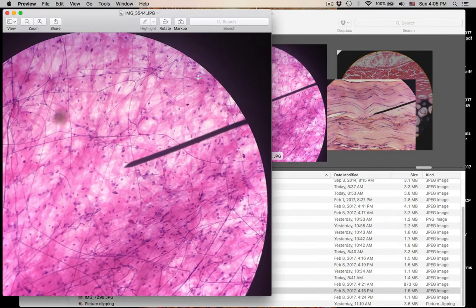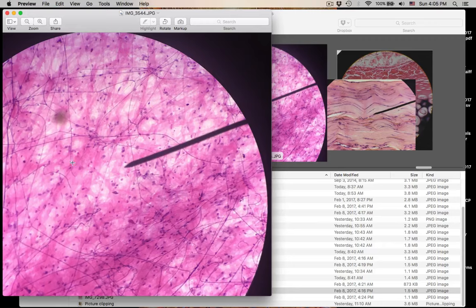Here's this connective tissue again. Just write it down. The next question is: what type of protein fibers are these skinny ones — these skinny hair-like protein fibers? Name those first. And next, what are these fat, thick pink protein fibers called?